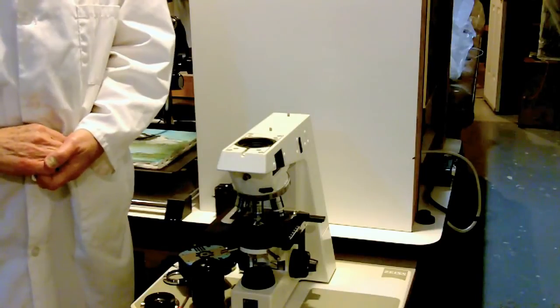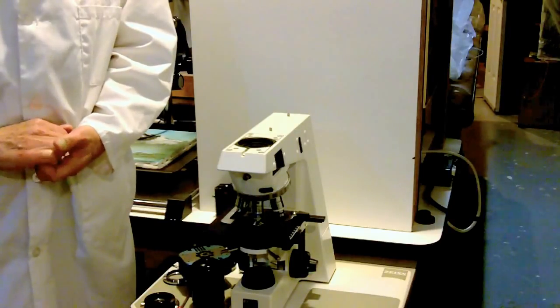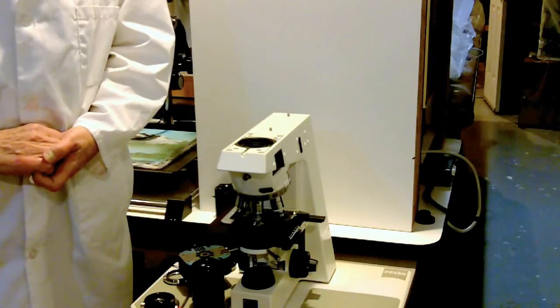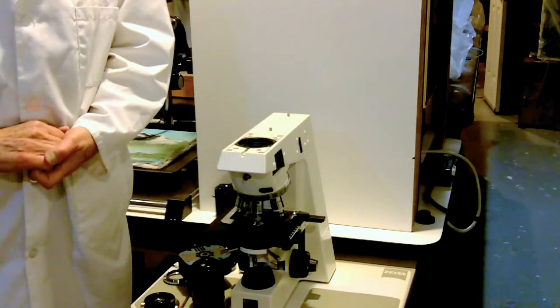Many of these microscopes have been put in surplus due to the fact that certain parts may be damaged or certain parts may be missing.